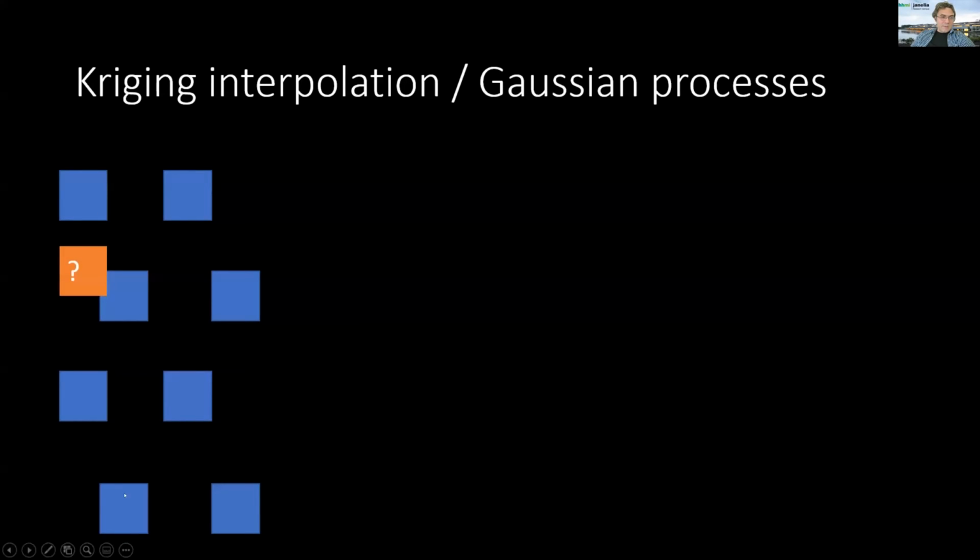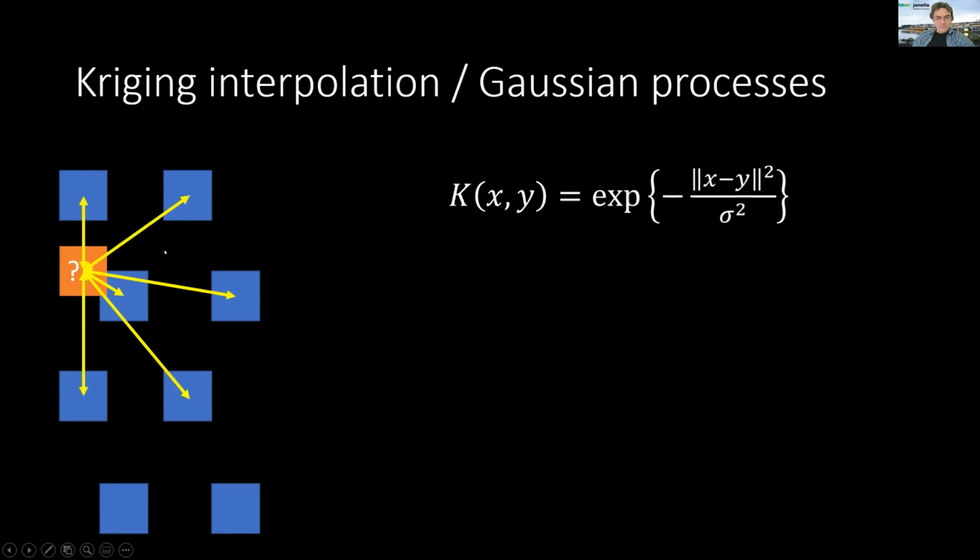Essentially, if we have any kind of arbitrary geometry like this, then we would like to know what the voltage is at this position here, because remember, we want to shift the probe by, let's say, half a site or a third of a site. So we'd like to know what the value of the voltage would have been at this position. For that, we set up a Gaussian kernel that says that the voltage should decay smoothly away from the center site.